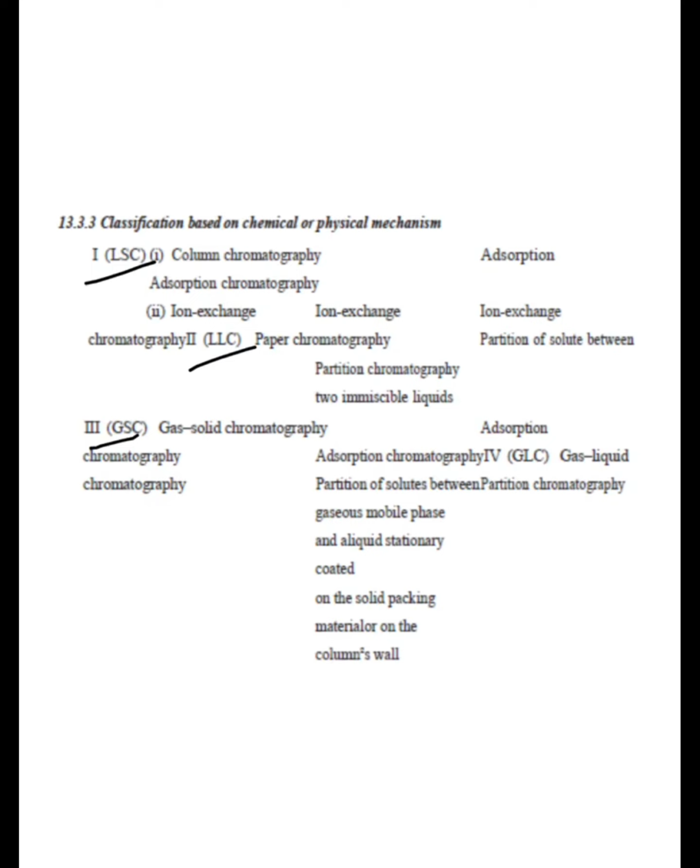In the LSC, liquid-solid chromatography, column chromatography is used here, and ion exchange chromatography.